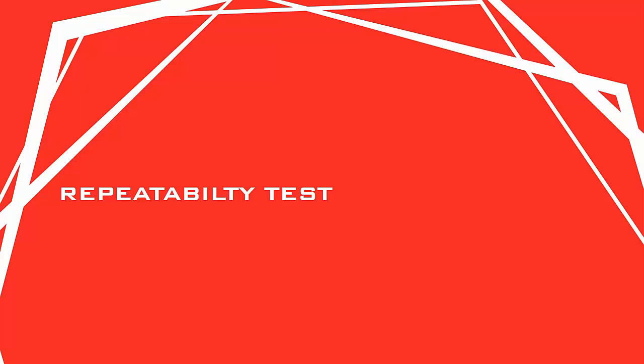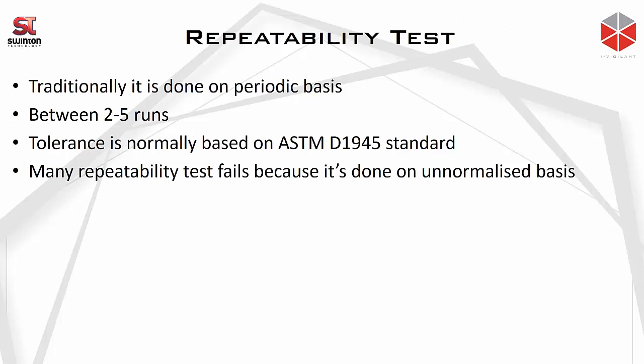Let's start talking about each individual task that we need to do. The first task here is the repeatability test. Repeatability test is traditionally done on a periodic basis. A lot of places actually do repeatability tests around once a month. The repeatability test is normally done between 2 to 5 runs, and the tolerance is normally based on the ASTM D1945 standard.